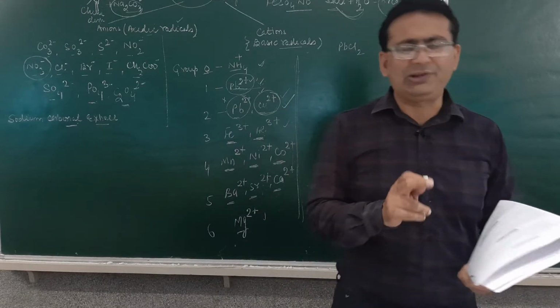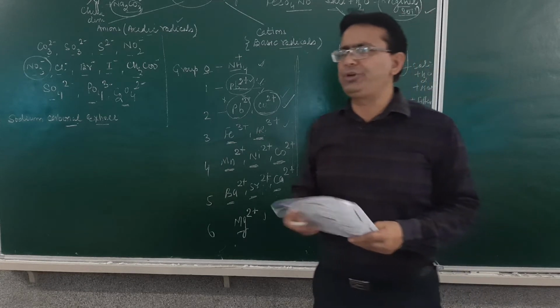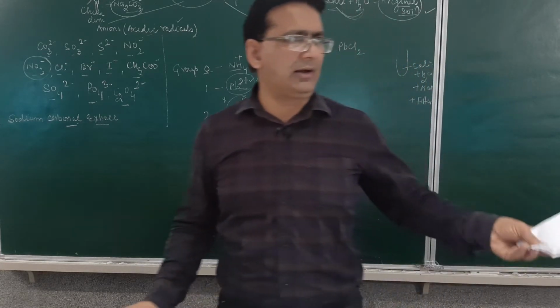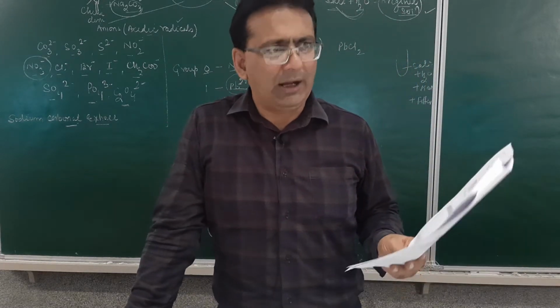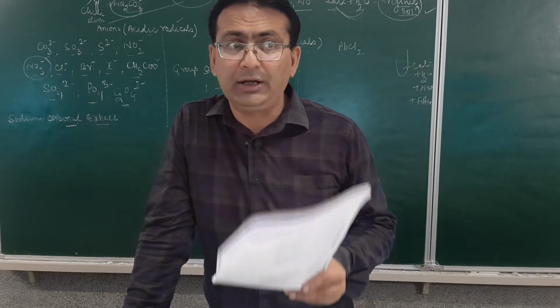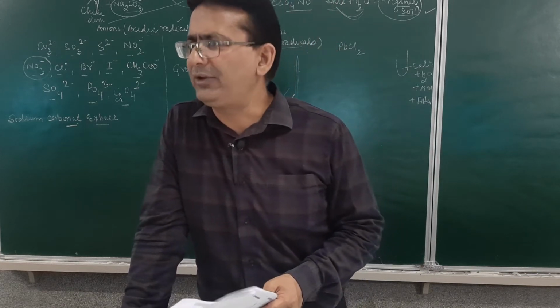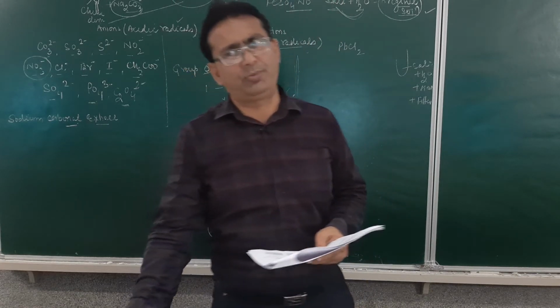Remember, the test is also given in the study material provided to you. What you need to do is study it very thoroughly. Today you will get first-hand experience of this. After going home, after conducting this experiment, your aim will be to read it and understand it very thoroughly, so that whenever you come next to the lab, you are able to perform the practical properly.